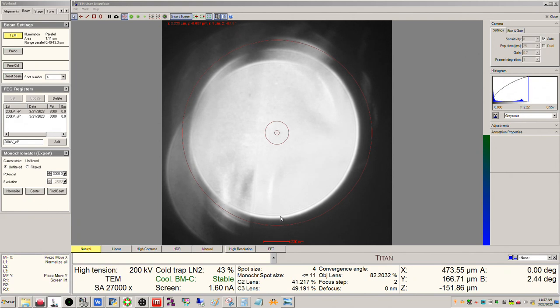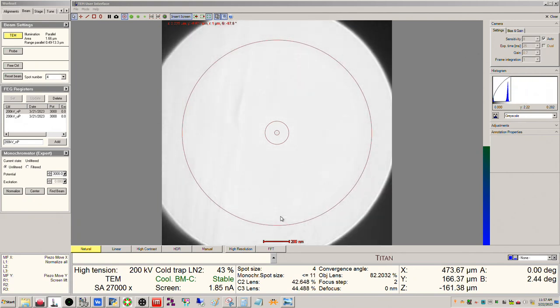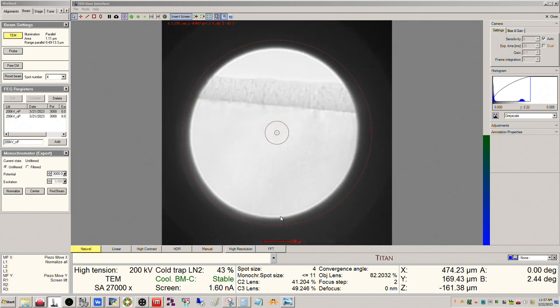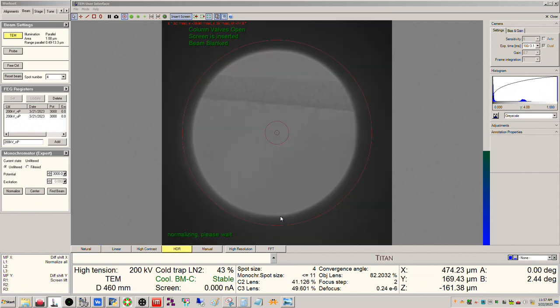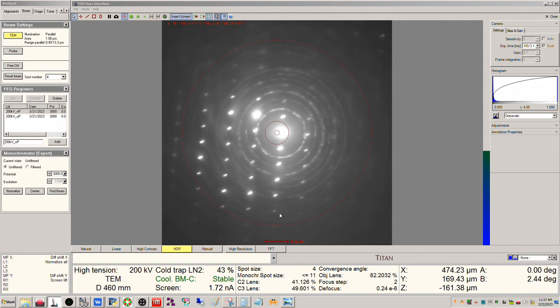So I can actually show you in the diffraction pattern the spot that corresponds to the 444 lattice spacing. So you can kind of see that. So this is a 111 oriented wafer. So this is the direct beam. So it's actually, this is 111, 222, 333, and then 444. Okay. So this would be the spot right here. All right. So we're getting closer.